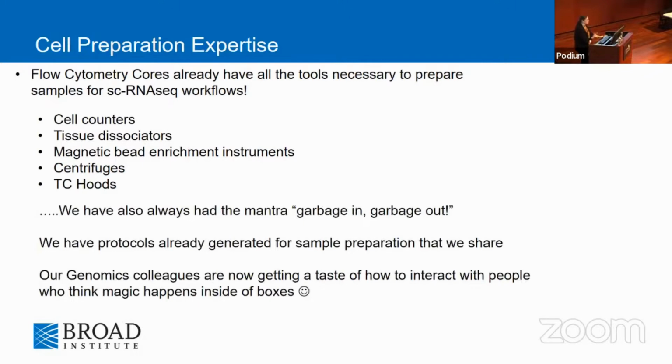And we always say, like, garbage in, garbage out. And that's the same thing with the 10x box, right? If you put garbage in, you're going to get garbage out in your data.